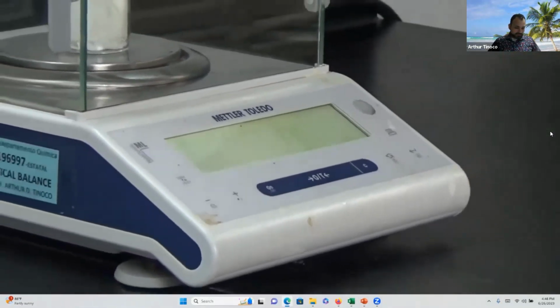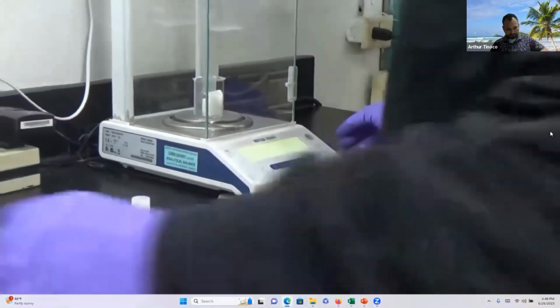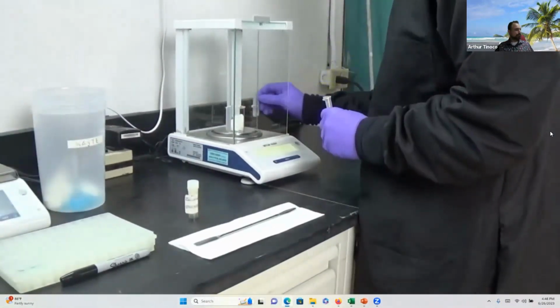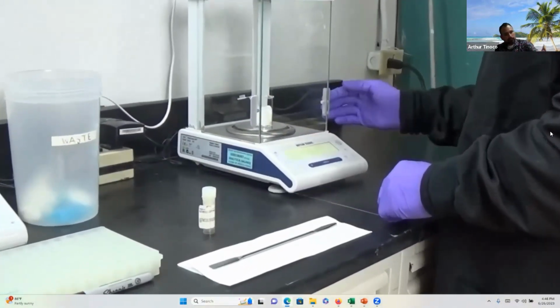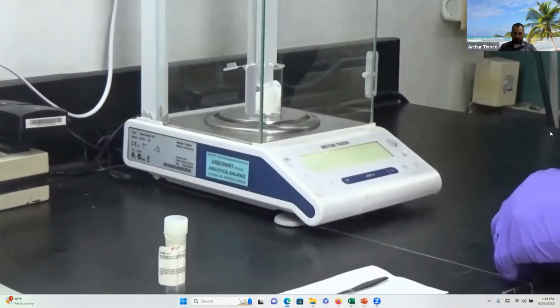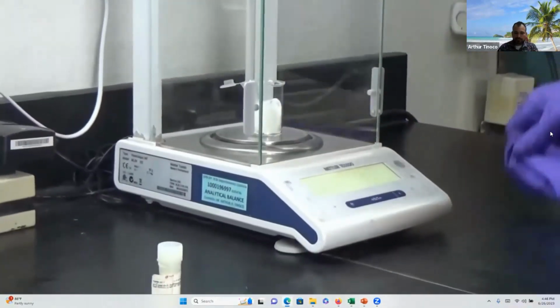Now I'm ready to weigh out the matrix. Because I'm going to collect a MALDI of a small molecule, I will use cinnamic acid as my matrix. What I like to do is use an epi in order to weigh out a small amount of the matrix. In this case, I am aiming for a matrix solution that is 5 mg per milliliter.